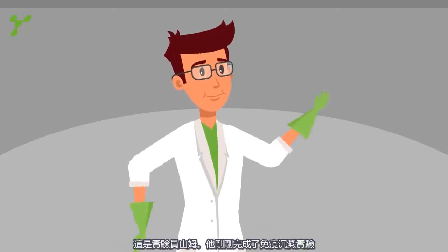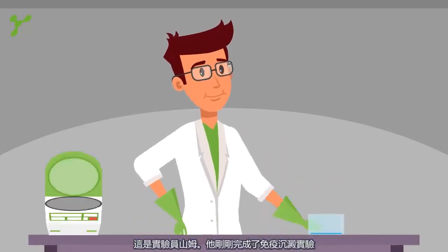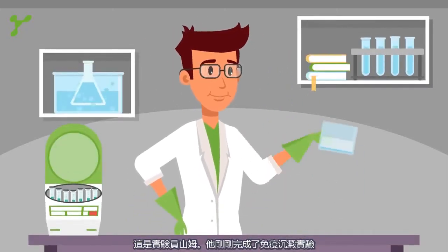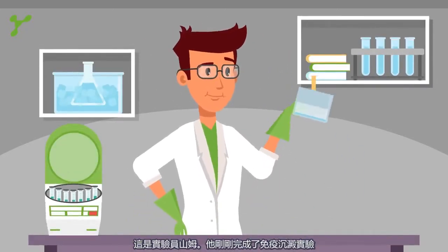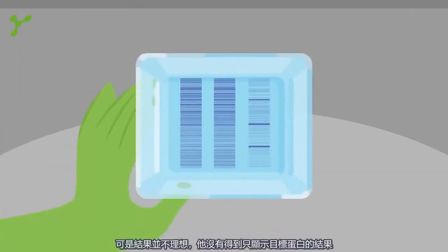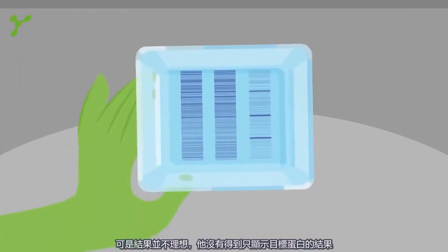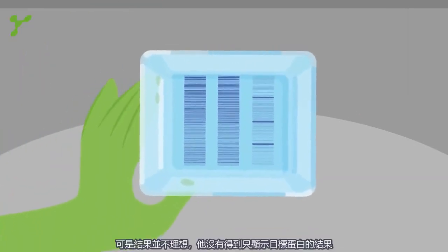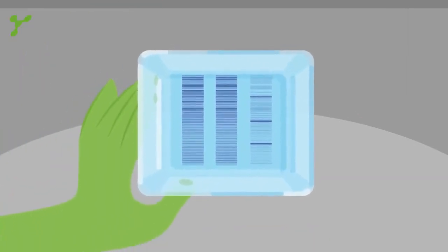This is Sam. He just completed an immunoprecipitation. It is impossible for Sam to see his protein of interest.